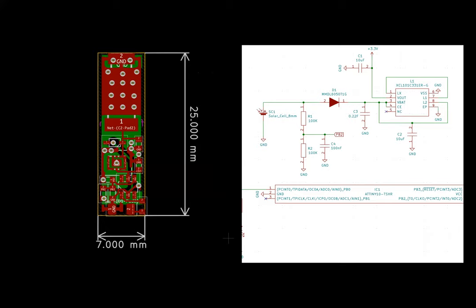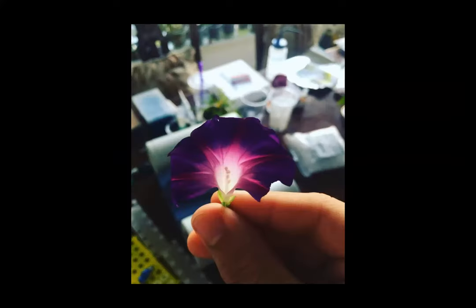And for amateurs, it goes an extremely long way because you can buy broken stuff off eBay and there's a pretty good chance that you can fix it with enough time. The bulk of the components that I have in my lab, like all the hardware, most of it is used, or I flip the used equipment on eBay and sold that in order to make more money, and then either bought brand new equipment or I kept the best ones for myself. So the overwhelming bulk of my lab is used stuff that I either fixed or bought and just refurbished essentially.